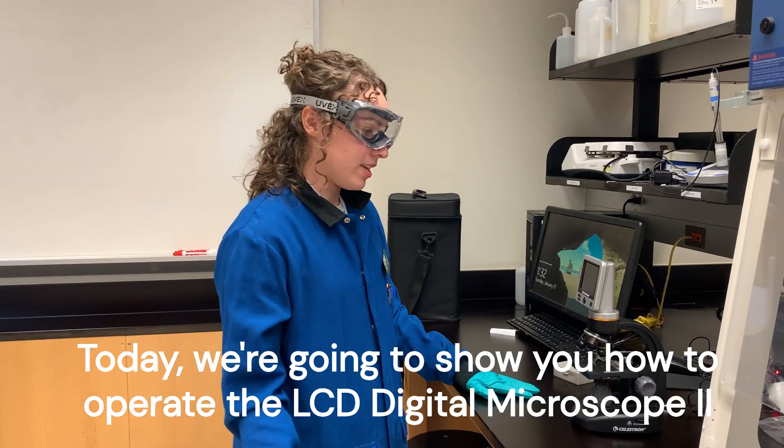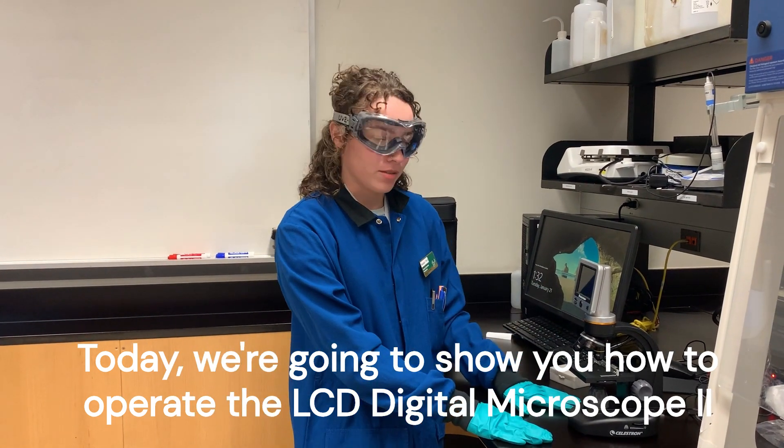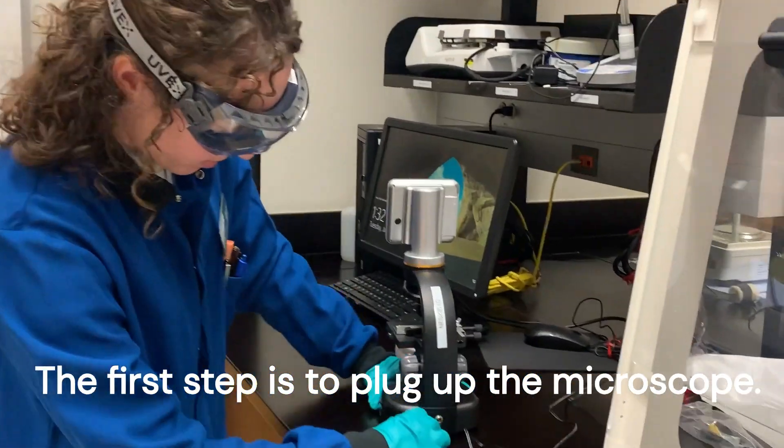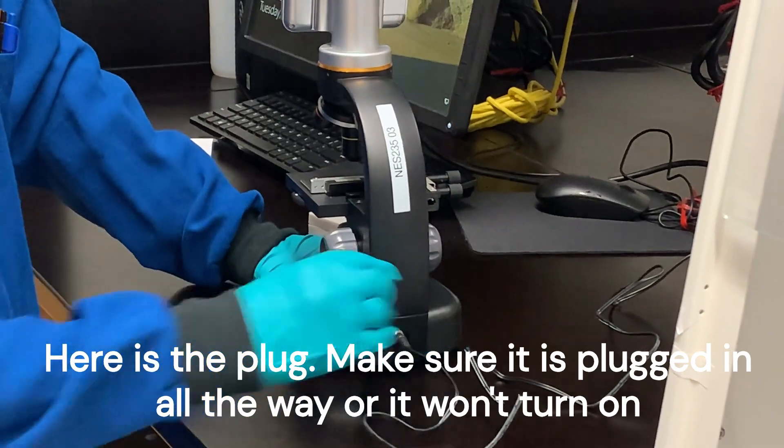Today we're going to show you how to work the LCD Digital Microscope 2. The first step is to plug up the microscope. Here's the plug-in — make sure it's plugged up all the way or it won't turn on.